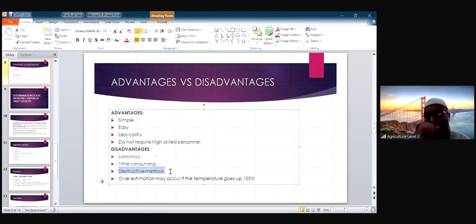That will affect your experiment. So you cannot destroy your soil. So you need to design this experiment in a different way. You need not collect soil samples. So the alternative is the tensiometer, as I mentioned.